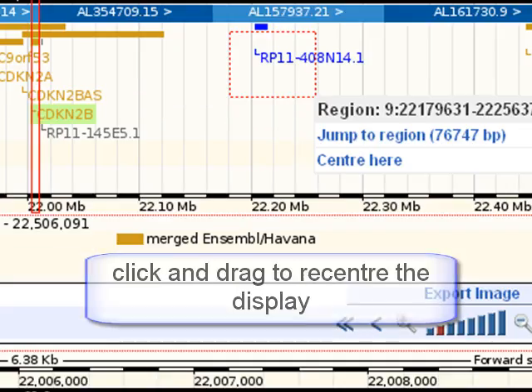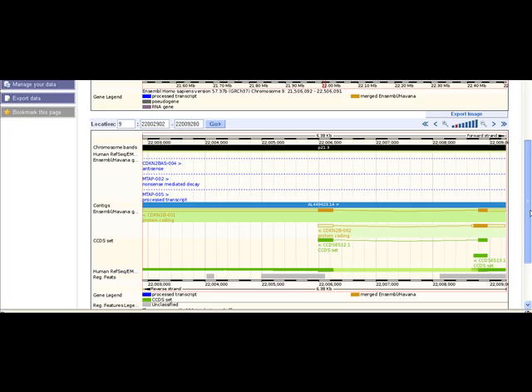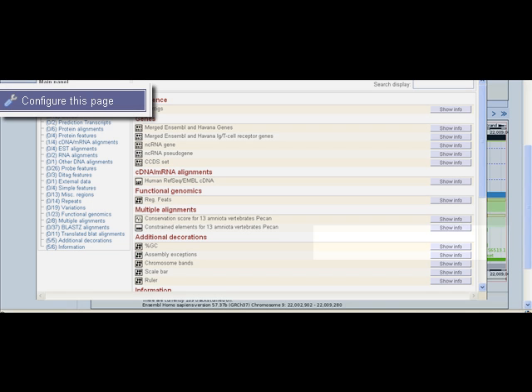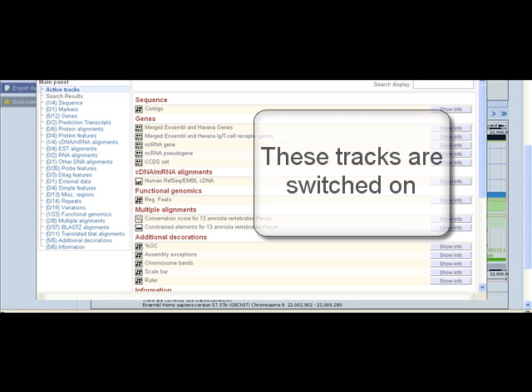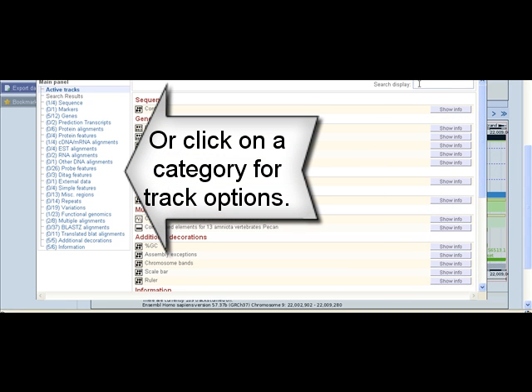Scrolling down, the CCDS track is shown with aligning regions in dark green. 'Configure this page' allows many more tracks to be drawn. Active tracks are shown here — these are ones already selected. Information for these tracks will be displayed if there is data for those tracks in this region.